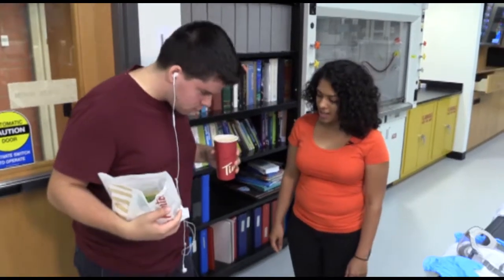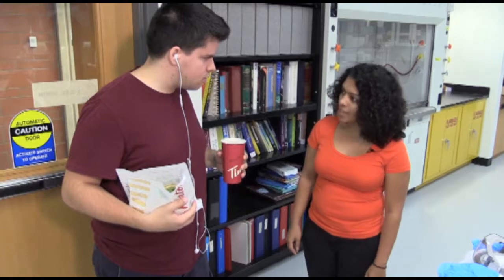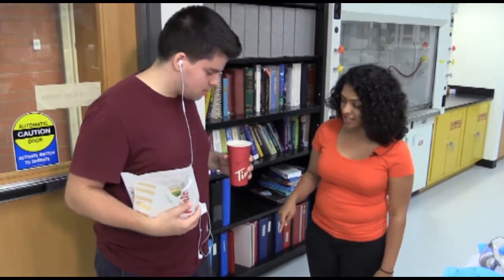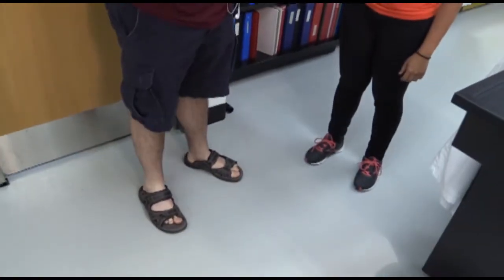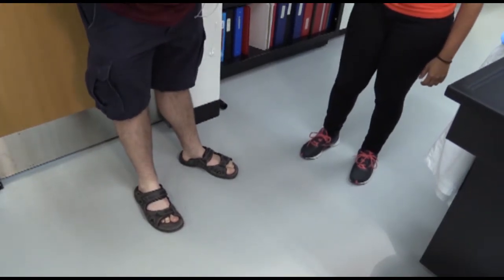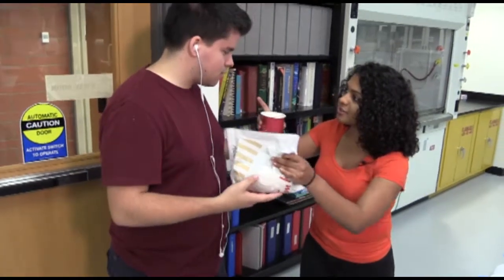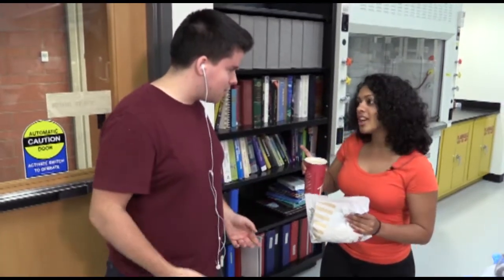Hi. Welcome. I'm ready to go. I don't think so. What's wrong? Where should I start? Maybe missing and I think I can take that from you. I'm hungry. You can go change and you can look forward to this after your lab is done.